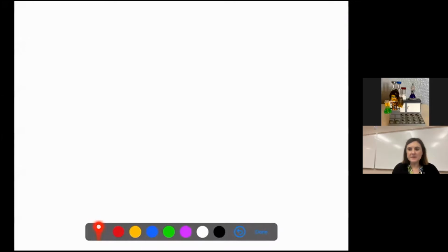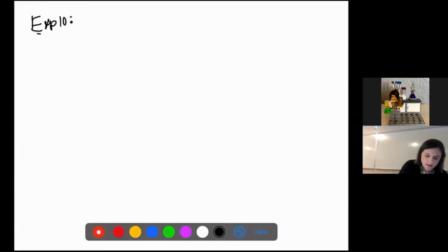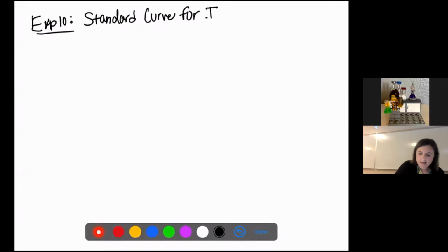Okay, so this is going to be a video that goes through some important aspects of experiments 10 and 11. A brief overview first is that experiment 10 is going to be used to create a standard curve for iodide, so I minus. It's going to be analogous to experiment 2 that we did earlier this semester, where we're going to have a standard curve of absorbance versus concentration of I minus in molarity. So that's going to be the point of experiment 10.